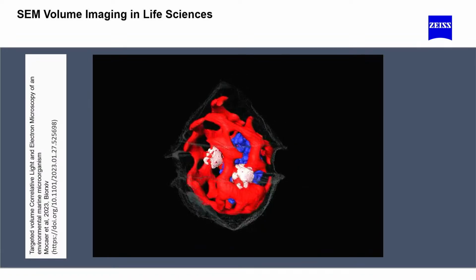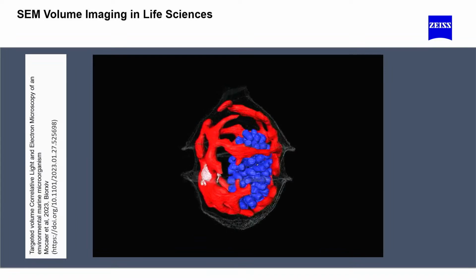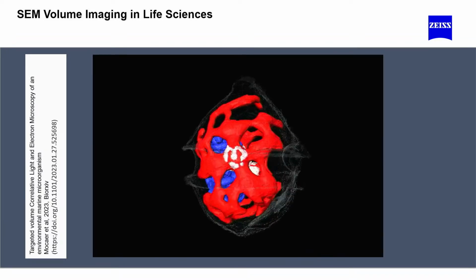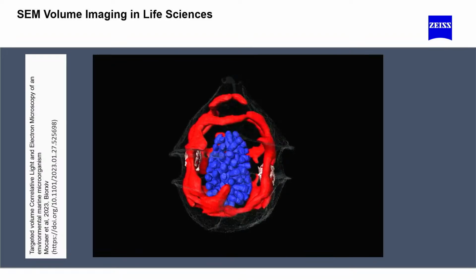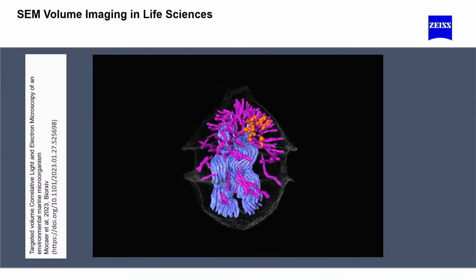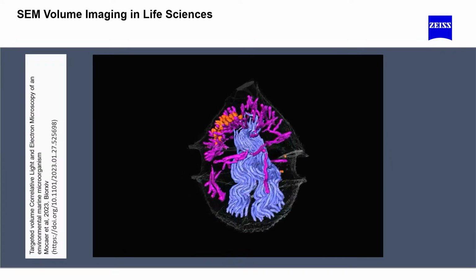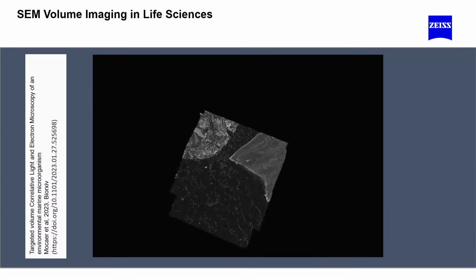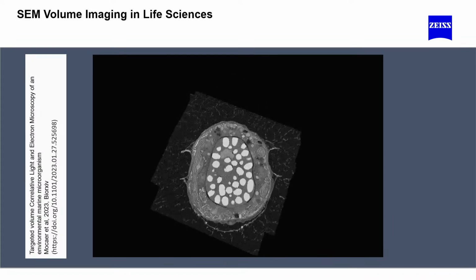Thank you very much for the nice introduction and for the opportunity to talk today. What I would like to do is lower the resolution from the previous talk, but increase the volume of the imaged area. Which means I would like to talk about scanning electron microscopy volume imaging.